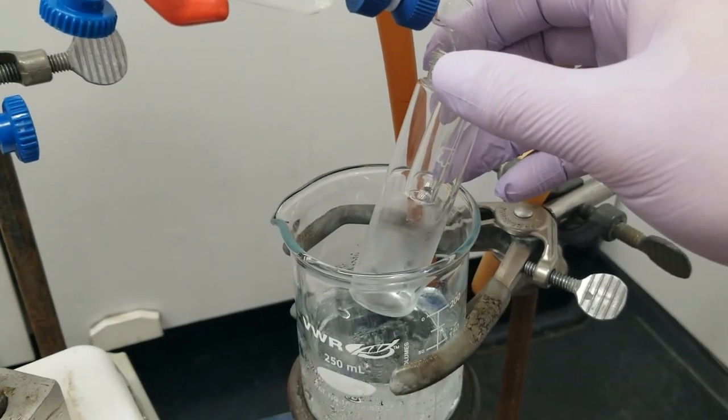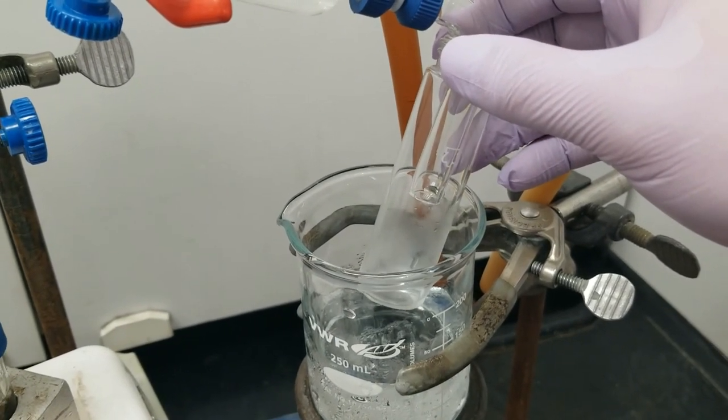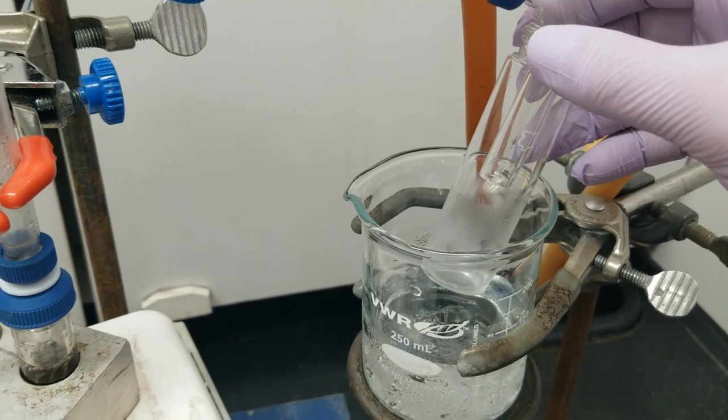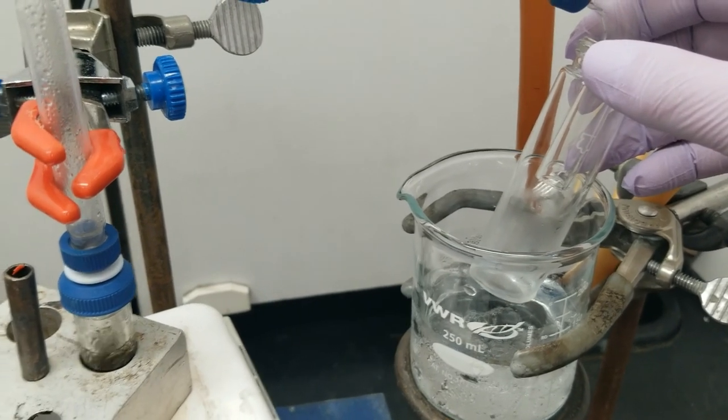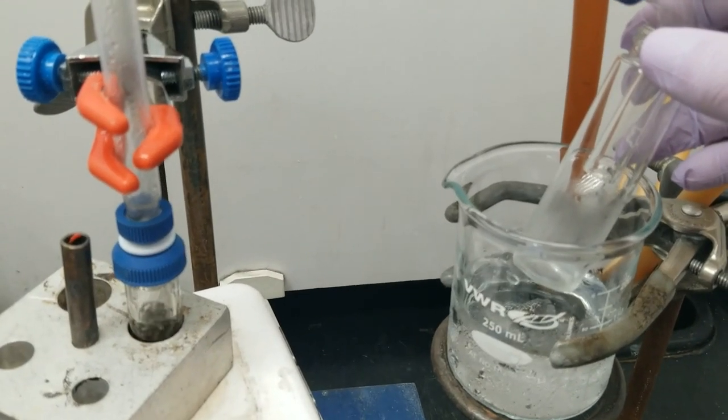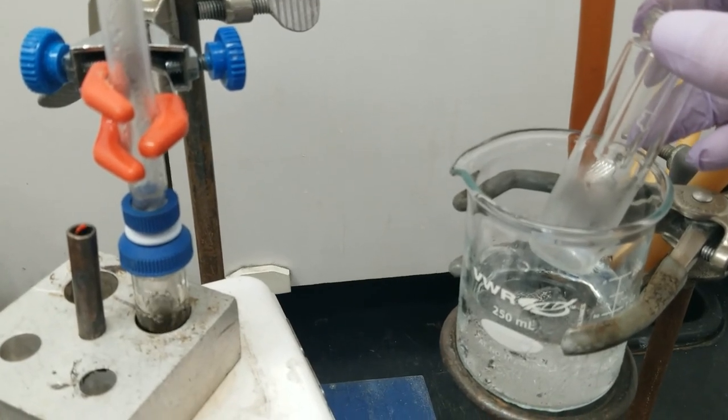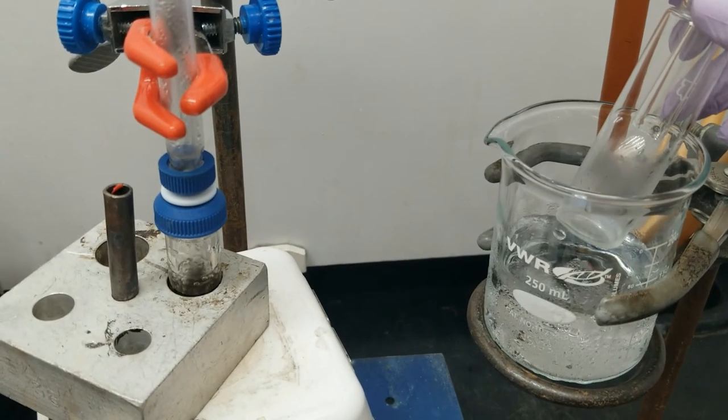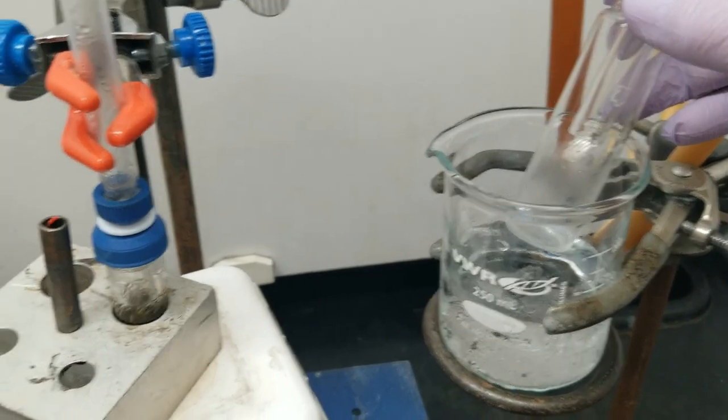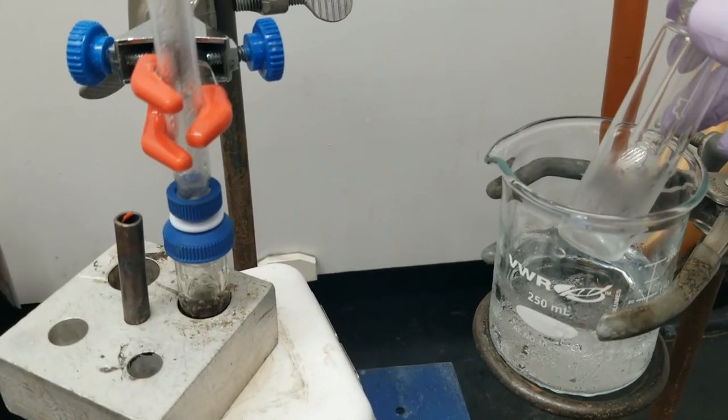And the way that we are going to characterize our product today is by IR. And we have some obvious differences between the cyclohexanol and the cyclohexene that we can look for in the IR. I'm also going to get a mass of this cyclohexene so that we can calculate yield.